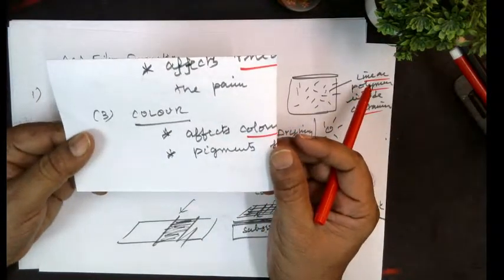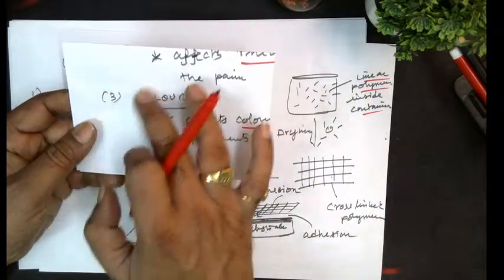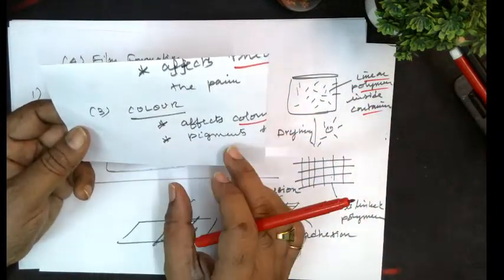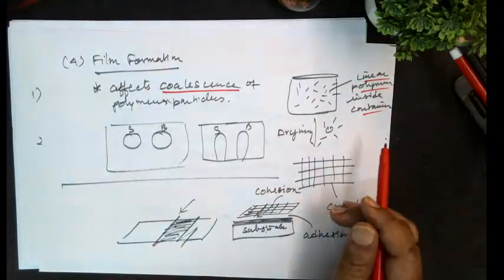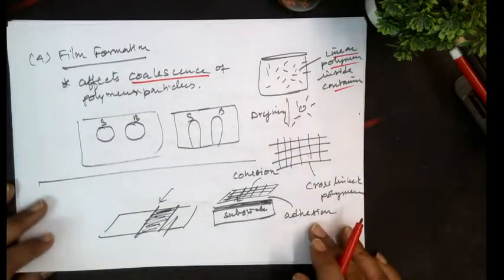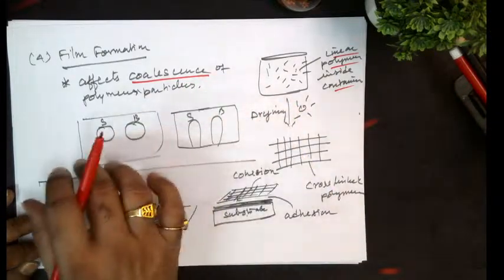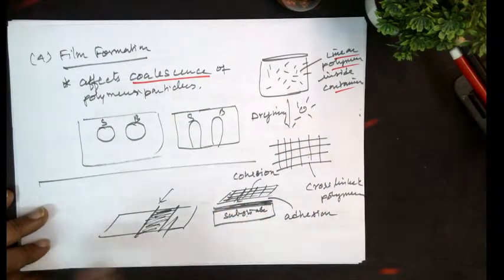This is called postcard size. You can drop the standard and your sample and tilt it, and it will form a neat flow of liquid. So you can study the film formation and the dry nature beautifully, and you can check for the presence of any extraneous matter also. So this is a flow experiment to test the coalescence, flow, and presence of extraneous matter during the film formation of the acrylic emulsion paint as well as the resin.